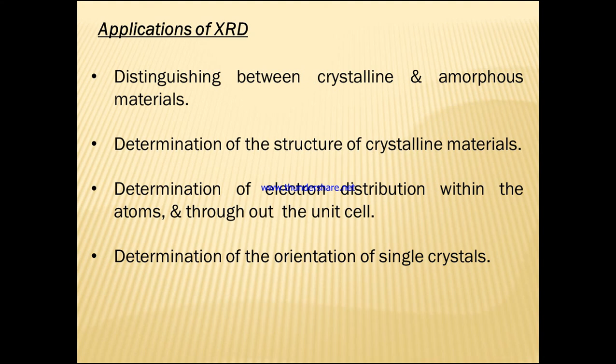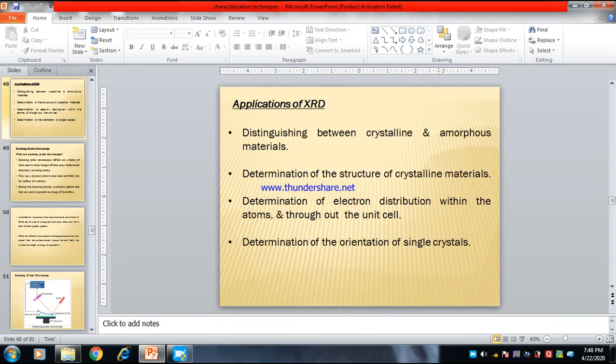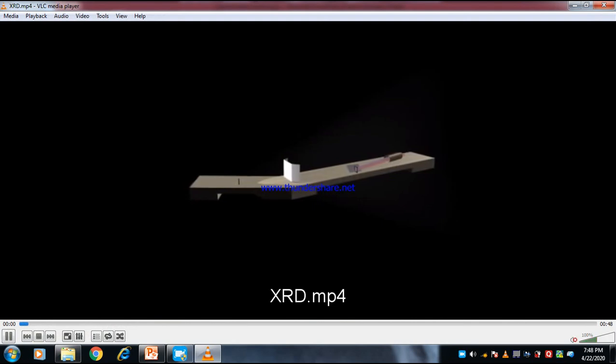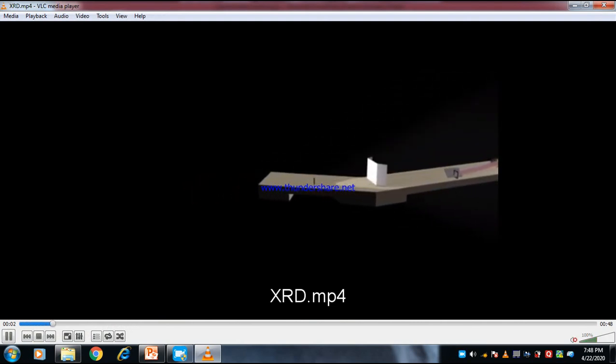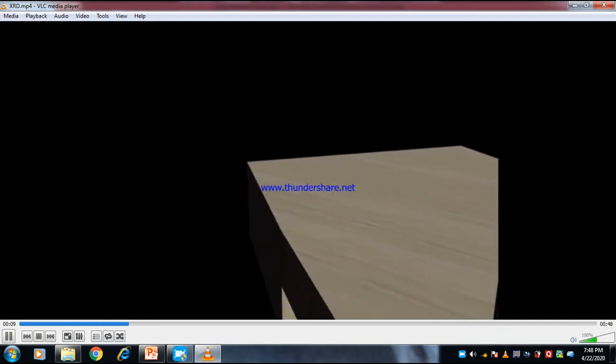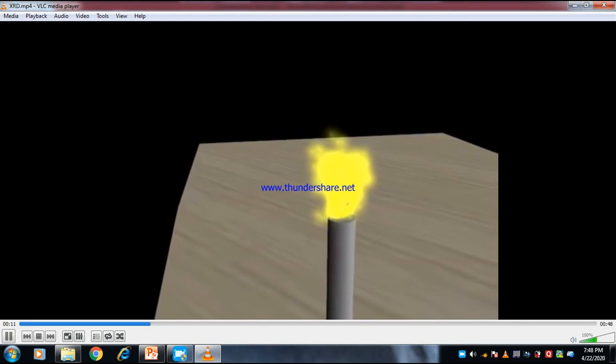We have one video with respect to this. We will watch how exactly the diffraction takes place. Please watch this video to get to know what exactly the XRD technique is.